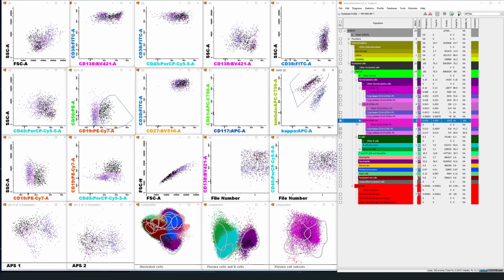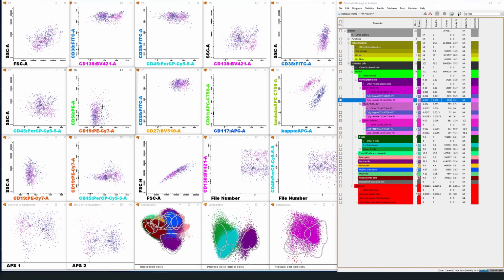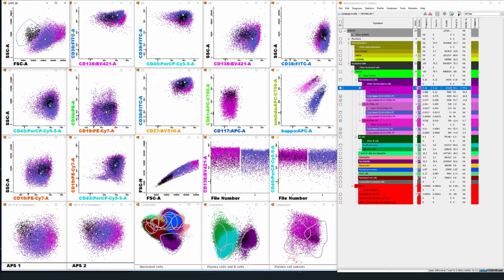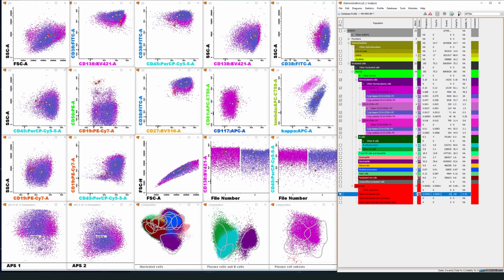And so, of course, if you removed some lambda and take them here, it improves the counts for both. And of course, these are kappa for the same, but it may not change the gate too much. So you have polyclonal populations. These are around 2 to 1, but they appear to be completely fine in most of it, maybe with some debris. But what we are most interested in is the abnormal population, so I'll put them up front in contrast to the normal ones.